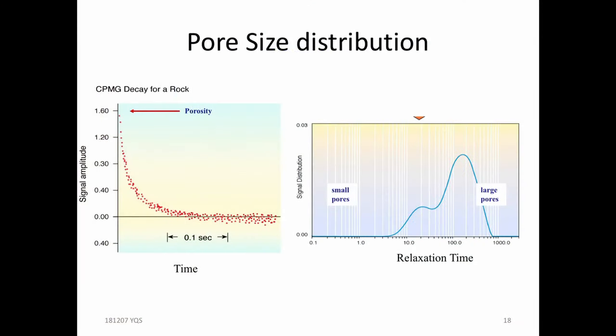At the same time, if you do the measurement, this relaxation often shows a multimodal behavior. So it's not a single composition. For crude oil, we all understand that it has a range of small molecules and big molecules, a whole range. This is the background I want to emphasize: when we measure something, it's always a big distribution.